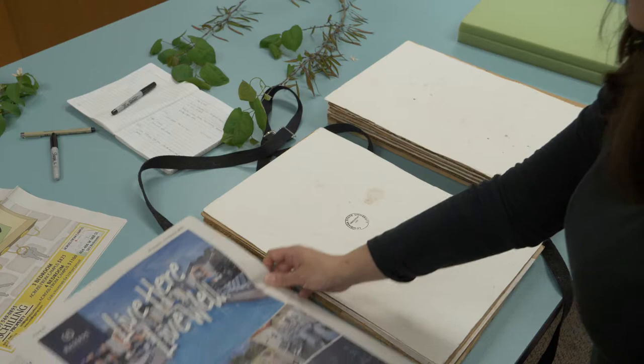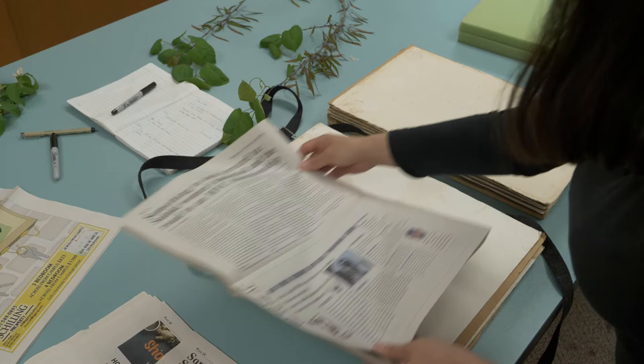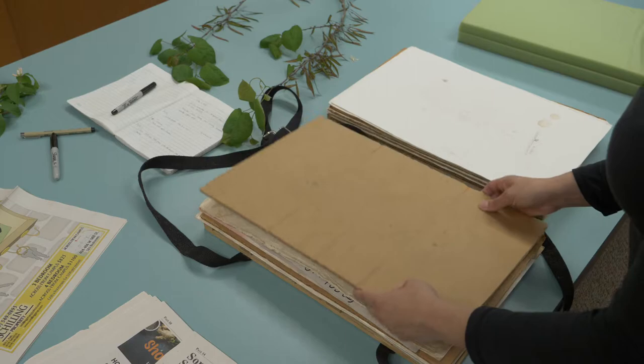Let's put them in the press. As I said, one specimen, then we make a nice sandwich. We put another blotter here, again the specimen, and again another blotter, and then a corrugate.